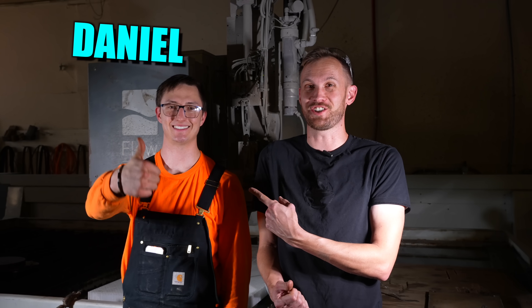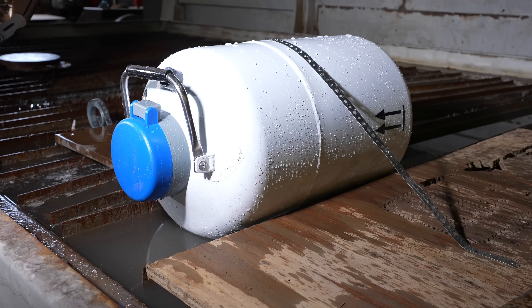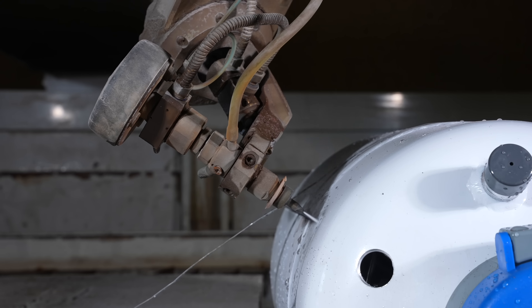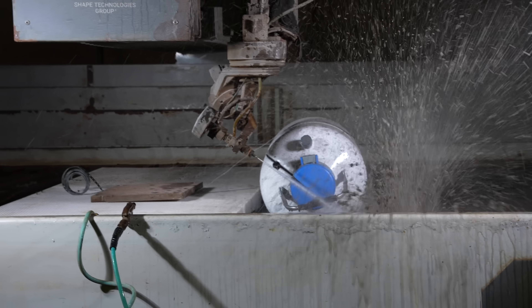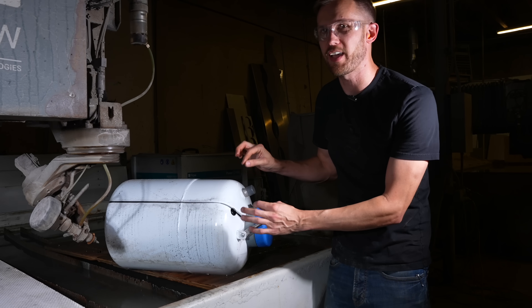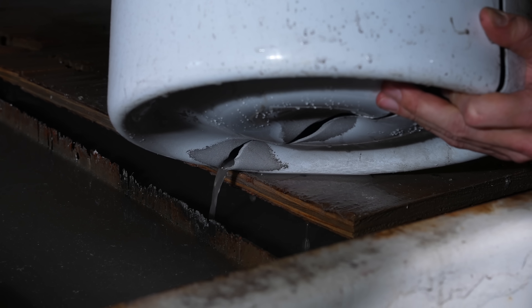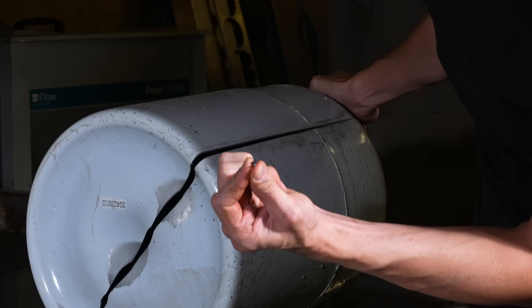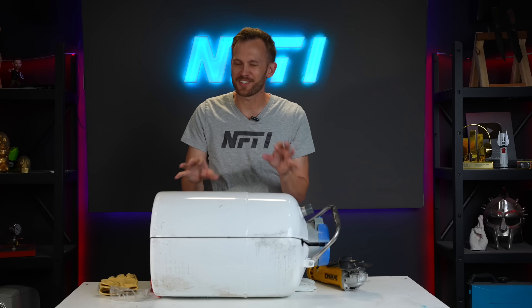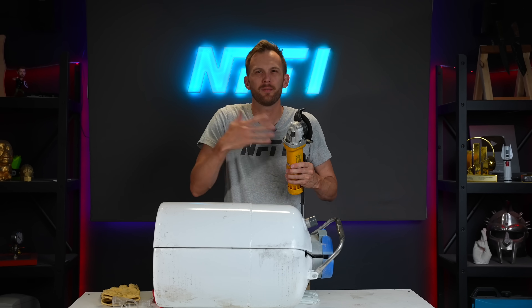Need to cut something tricky in half? Ask Daniel at the Waterjet Channel. This giant machine can cut through pretty much everything. We've got the dewar set up on the machine and we're going to slice it in half to see what's inside. This is almost entirely cut through — there are a couple of really weird thick areas it didn't want to go all the way through, but that's okay because it lets us take it back to the workshop mostly in one piece. It's full of water that's just going to pour out, and there are also little bits of charcoal coming out, so we're going to find some other stuff in there as well.